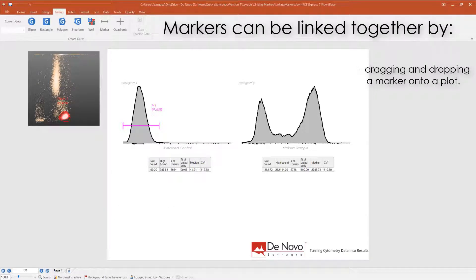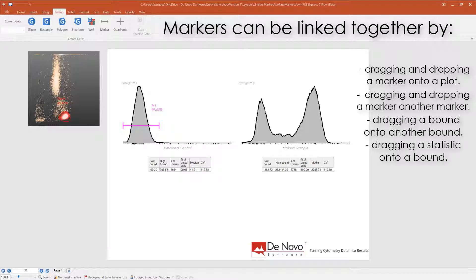dragging and dropping a marker onto a plot, dragging and dropping a marker onto another marker, dragging a bound onto another bound, or by dragging a statistic onto a bound.